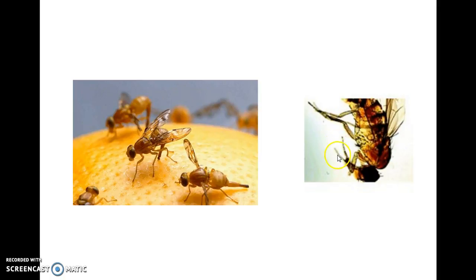So for example, on this microscope slide, this Drosophila, I only see one, I can't tell if that's a leg or not, 1, 2, 3, 4 legs on this particular fruit fly. But because it's an insect, we know it should have 6 legs. Insects are 6-legged creatures. So you might not see all 6. Sometimes the wings get folded under the body as well. But anyway, that's the first slide that I'd like you to take a look at and answer some questions about.